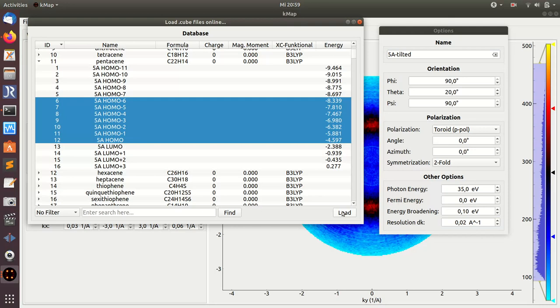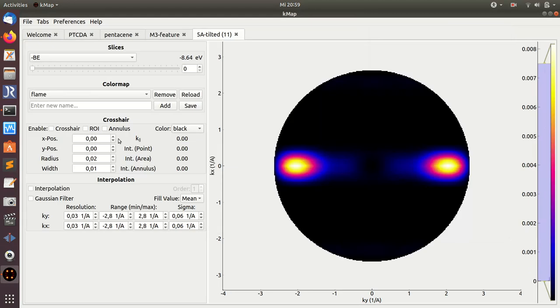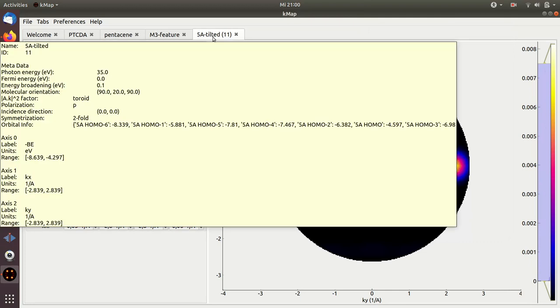Now this will take a few seconds because now all those orbitals, seven all together, have to be downloaded from the internet. The cube files have to be downloaded, imported into KMAP, and then stacked together. Now it's already finished. So what I see here is again a data cube of photoemission intensity. I see here again a tooltip where I get the information about what has been chosen on the import as metadata information.